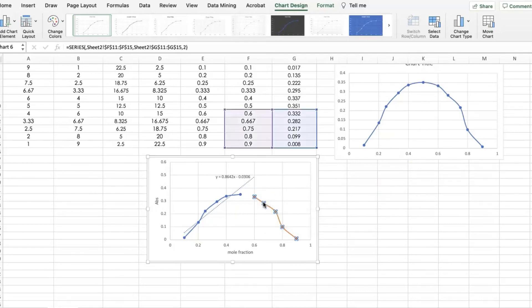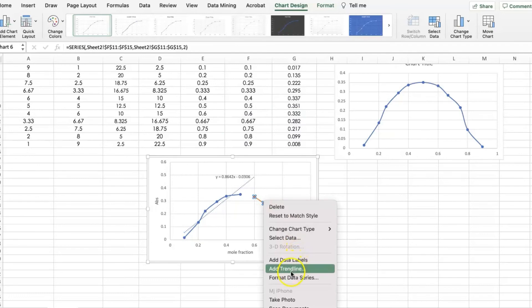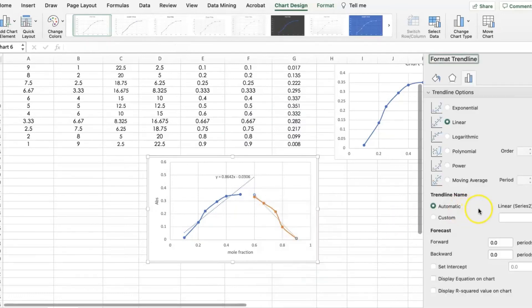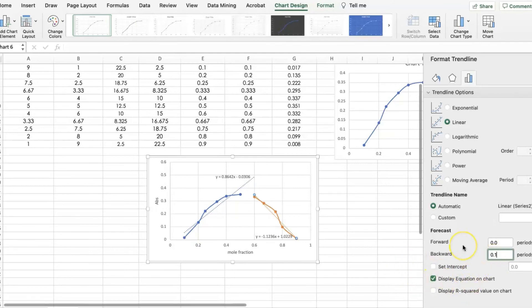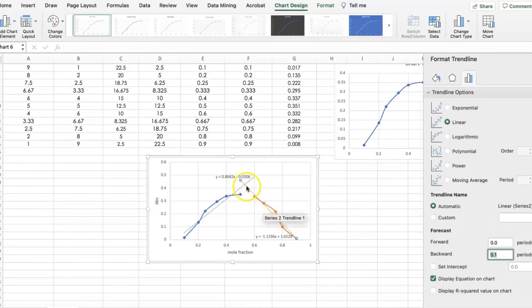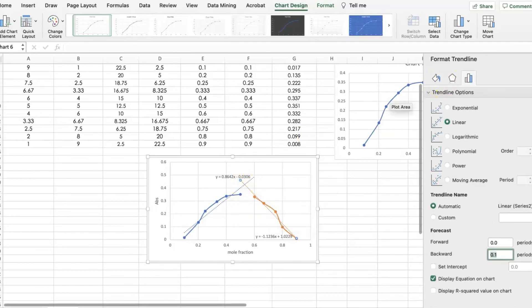Click the second plot, right-click, and select Add Trend Line. Set it to linear, display the equation on the chart, and extend it backwards by 0.1. As you can see, the lines are now extended so that we can also see the intersection of the two lines.